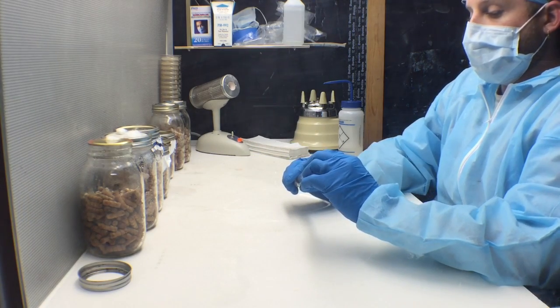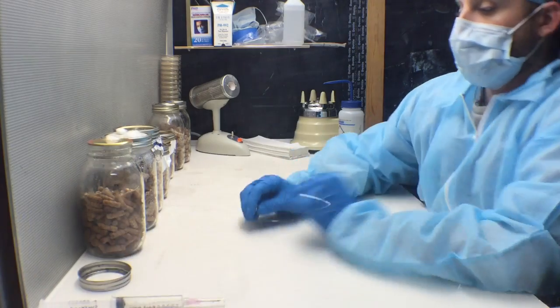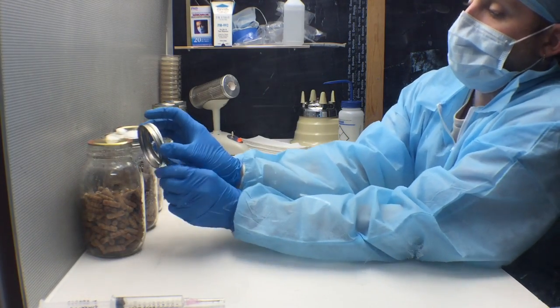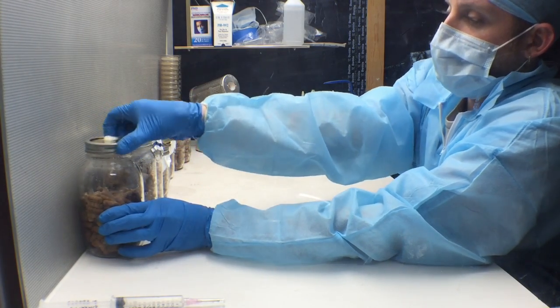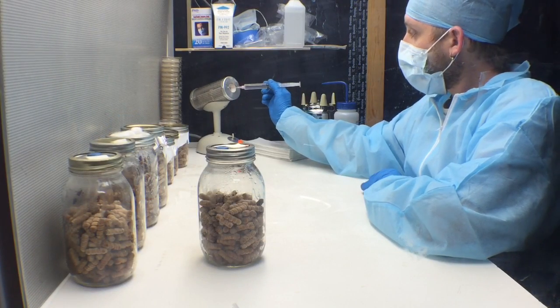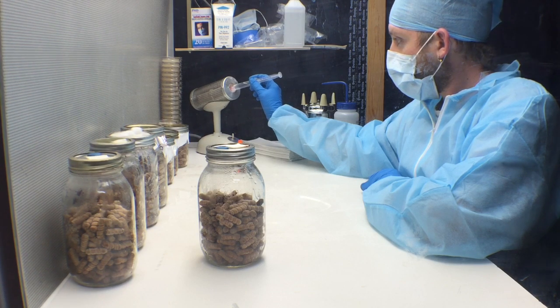Now you've just inoculated your jars and you can put the ring back on. Between each transfer, make sure to sterilize all tools. The needles will be sterilized every time we change jars.